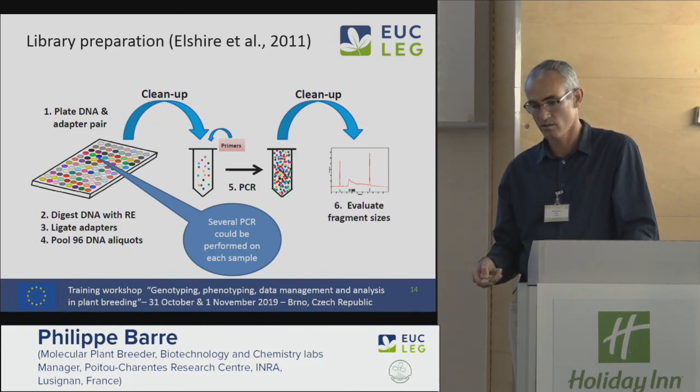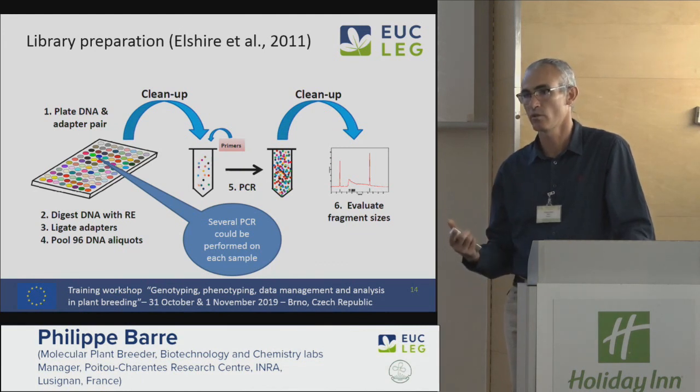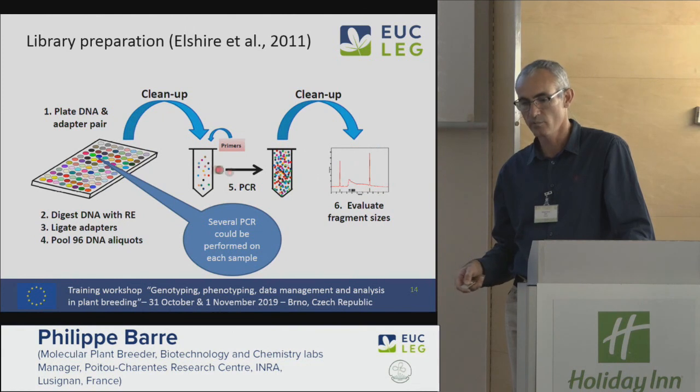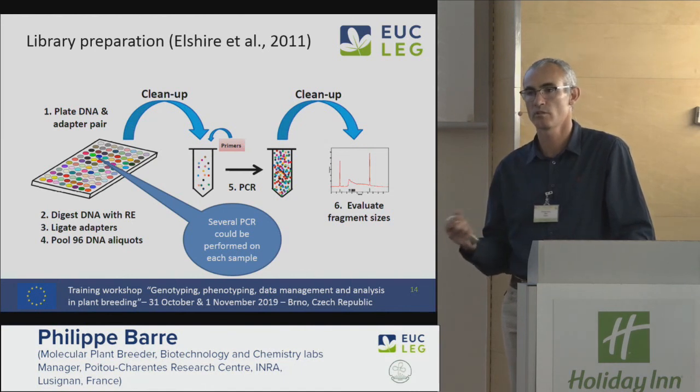And so here you clean, and you got this, and then you have the PCR that you do on one pool. So it's also a bit expensive, but you do it on all together. And again, you clean, but it's on the pool and all together. Here, PCR, you do several PCRs to avoid problems if one PCR is not working well.